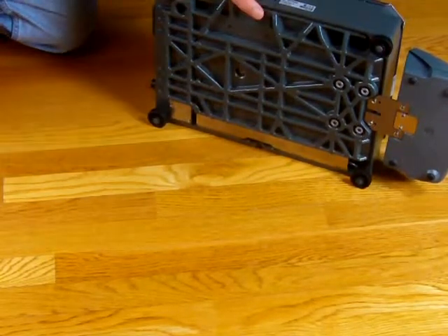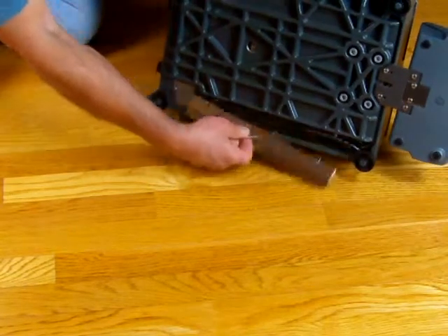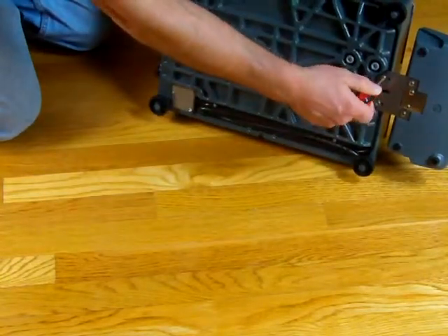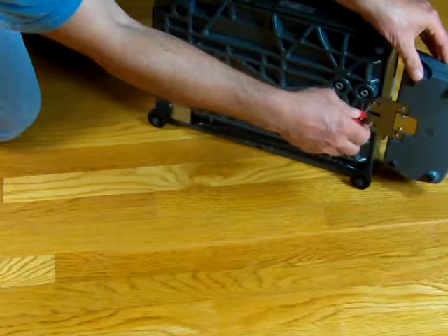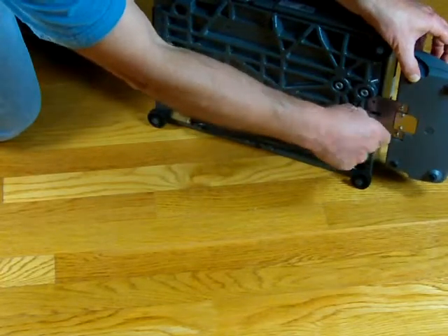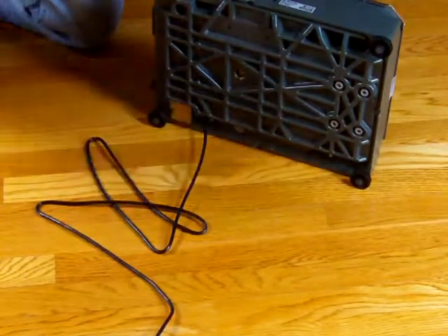The balance also has this shroud here which can be removed — underneath is actually five feet of cable. So this shroud comes right off, and if you wanted to, this indicator head could be removed and placed on a bench. Some materials labs might want the indicator head away from the platform so they don't crush it. Again with Sartorius you get complete flexibility — now you have the indicator that can be removed from the platform and you can do any weighing application you'd like.